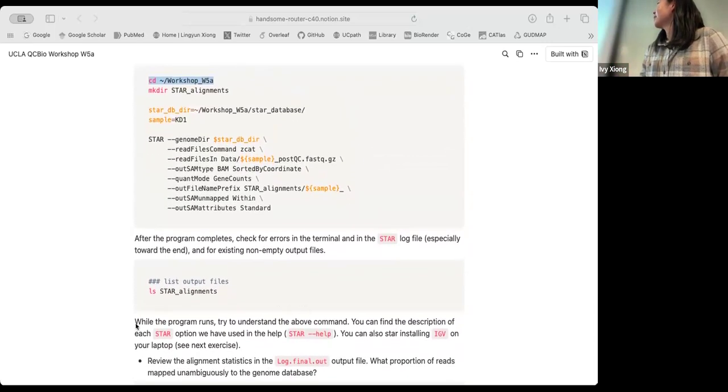Yeah, so you can check out what the code means. Some of us were asking about the SA index, so I looked it up. That's one of the parameters. I will put it over here. For each of the software, it has very extensive manuals that explain what each parameter means and any guidelines they have for you.